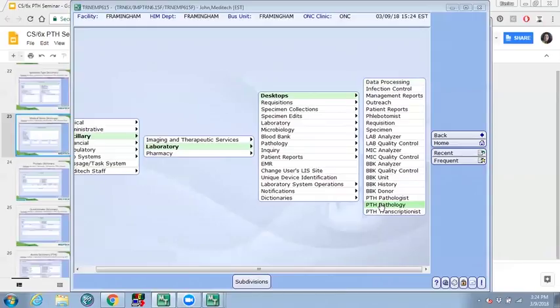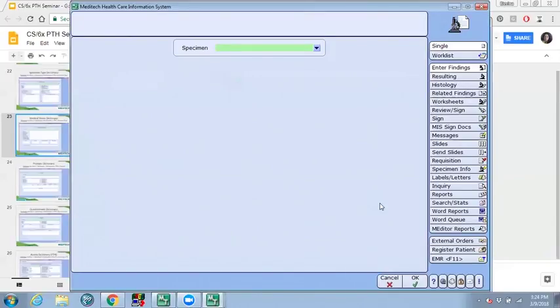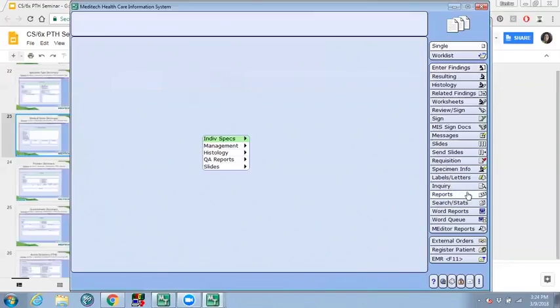In the meantime, if you have any questions regarding all of the dictionaries that I went over from pathology department, data section, specimen type, and medical term types, please let us know in our Q&A section or the chat while we see how everything is being tied together.